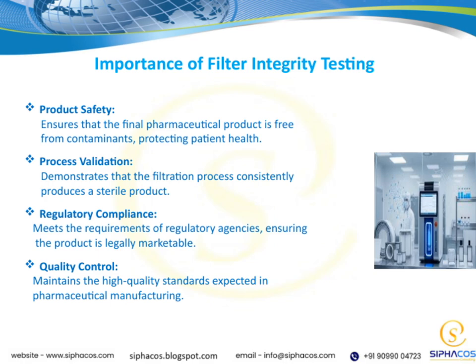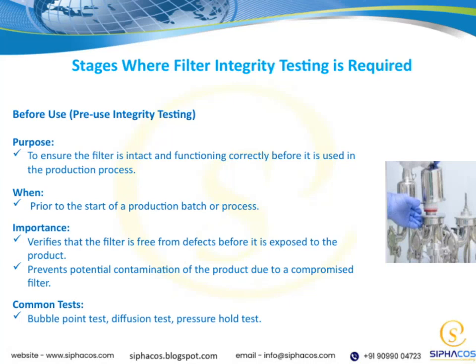Ensuring filter integrity is not just a technical step. It's a critical part of protecting patient safety and maintaining the integrity of our products. Before using a filter, it's essential to perform what we call pre-use integrity testing. The main purpose here is to make sure that the filter is completely intact and functioning properly before it actually goes into the production process. This step helps us confirm that the filter can perform its role effectively.